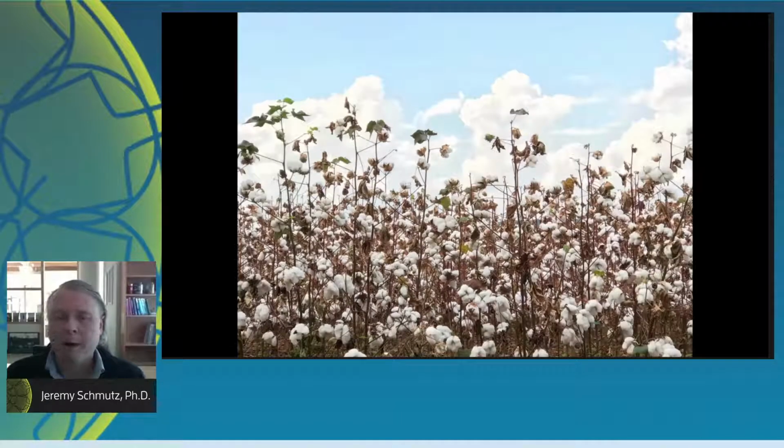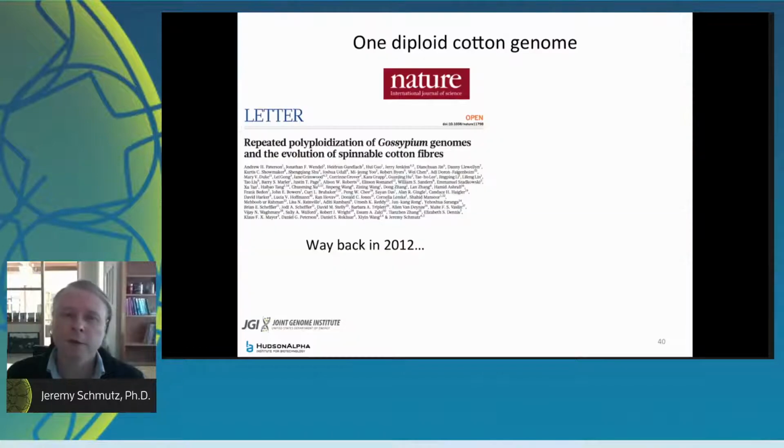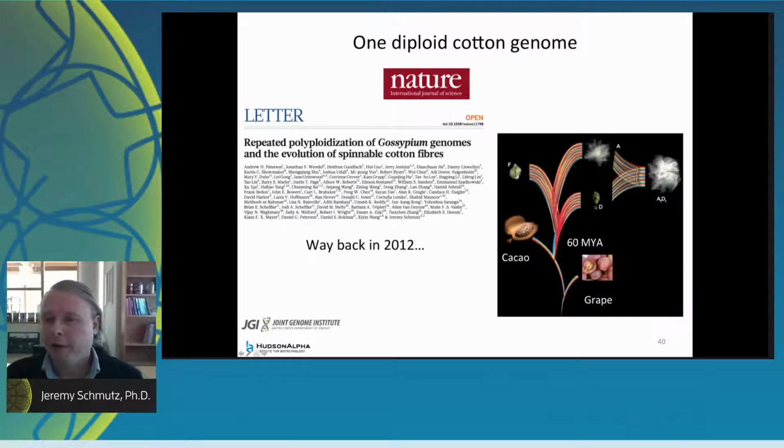So I want to talk a little bit about cotton. Cotton projects are managed here by Avinash, and then with a lot of effort from Jerry's group and James' group for sequence and analysis, production of genomes. A long time ago in 2012, we produced the first diploid cotton genome, which is called the cotton D genome. It's right here, looks like this, doesn't produce a lot of fibers.